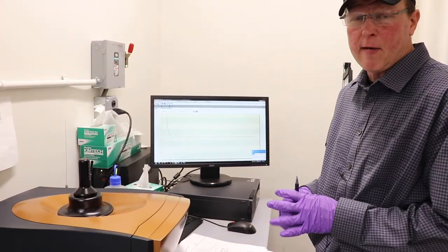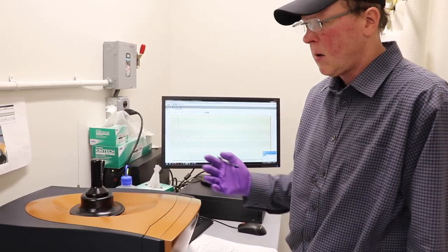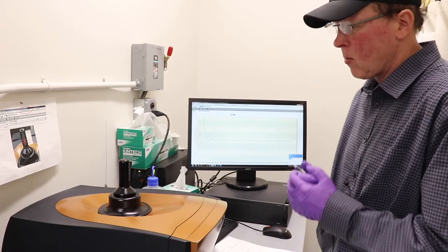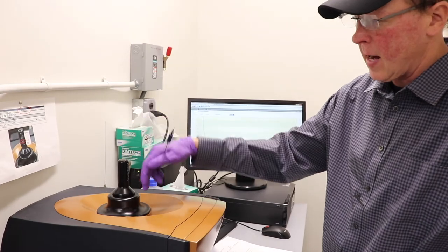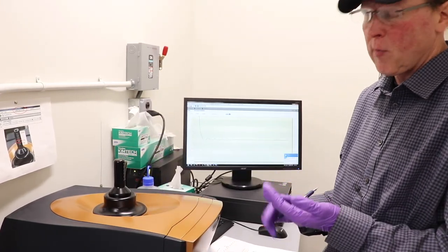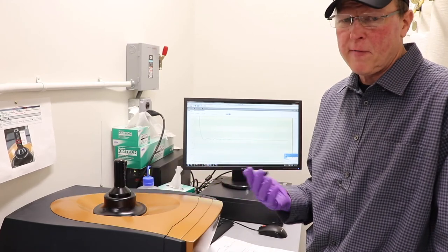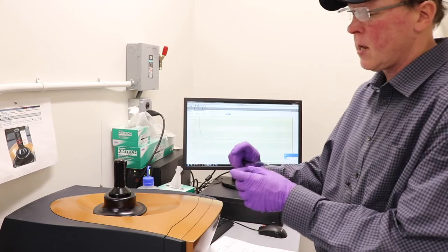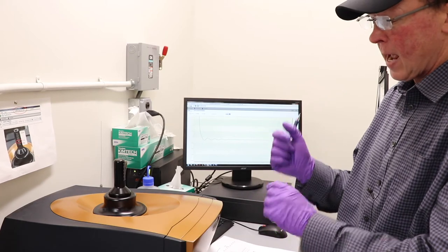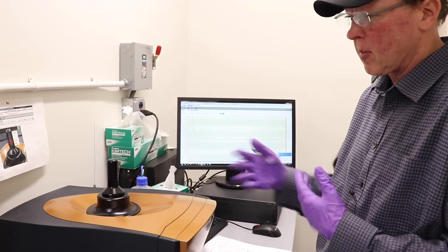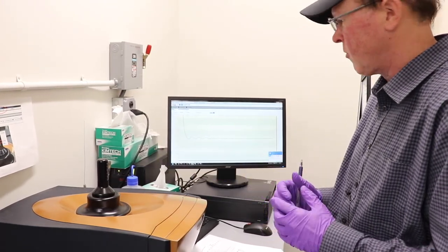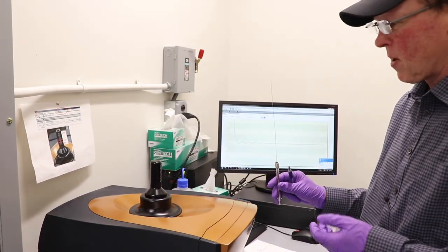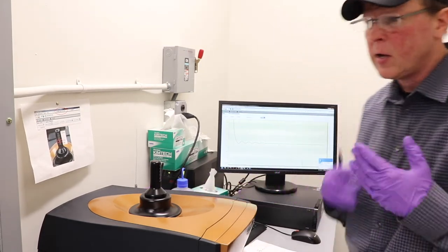Okay. So you want to do your own experiments. As I've mentioned several times, when you're finished, you want to clean the cell well and do a water-water test at the end to show that you've cleaned it and it's ready for the next user. I may have mentioned it before, but I'll mention it again. One of the biggest problems is the sample precipitates inside the sample cell when you add your titrant. Two ways to avoid that. First one is flush the cell out with your buffer three times before you add your protein to avoid precipitation. Two, if this is an unknown experiment that you haven't done before, do a mock titration in an Eppendorf tube where you take your protein and you add some of your ligand in there to see if it precipitates. Basically you're just doing the same experiment, but you can see what's going on rather than being in there. That'll save you a lot of trouble. Also, when you take your sample out of here, remove the sample with the sample syringe first, flush it a few times with your buffer, and then go to flushing it with water. Because if you add water right to your protein sample, you're likely to precipitate it.